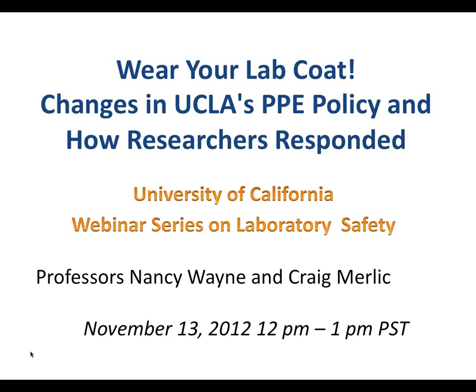In the teaching laboratories, these rules are not immediately applicable. However, we have a responsibility to make sure that the teaching labs have a high degree of safety. So in the chemistry labs in my department, the undergraduate students in their lab classes are now wearing the blue flame-resistant laboratory coats as the standard requirement for the laboratory course. Those lab coats are required, and the students buy them because it's part of the course materials that they're using.